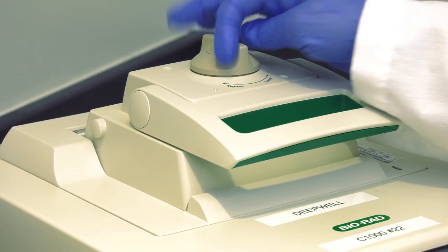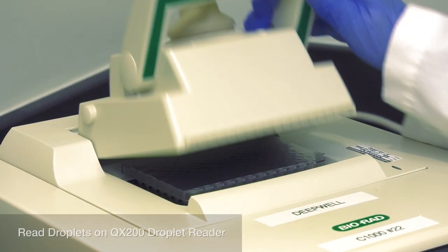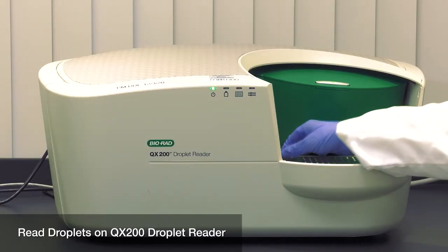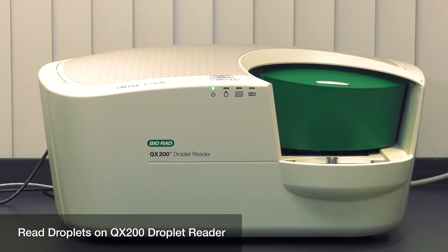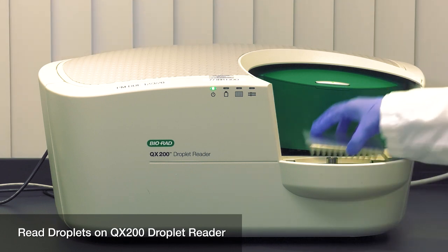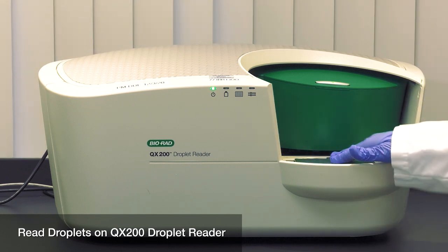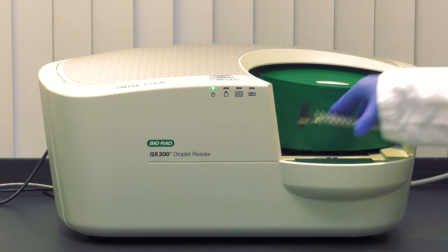Proceed to reading of droplets in the QX200 Droplet Reader. Read droplets within 24 hours of thermal cycling completion. This workflow normally generates slightly fewer droplets than other reactions. It is not unusual to see 10,000 droplets or fewer per well.